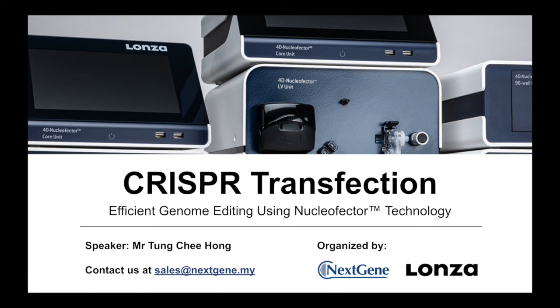Therefore, sometimes we will perform something called a mutation efficiency test to check which one actually has the best efficiency before we continue with the experiment. Because to me, the experiment is actually quite straightforward, but the harder part might be the screening of the edited cells. So before we screen for the edited cells, maybe we want to test which guide RNA has the best knockout efficiency, and only then proceed to the screening, in the case that you want to look for the edited cell. Yeah.